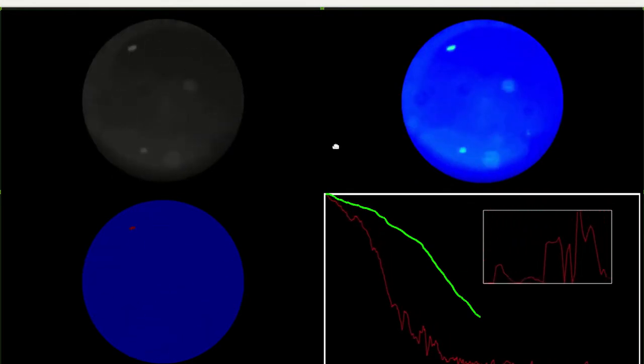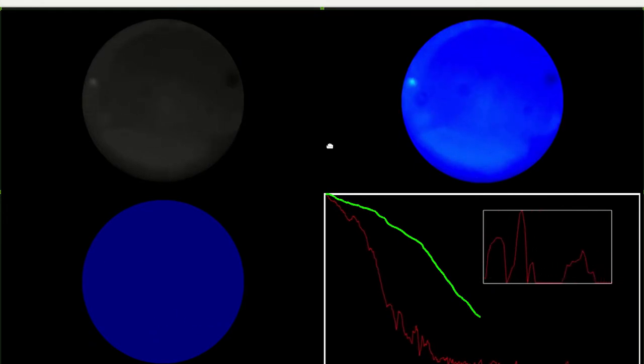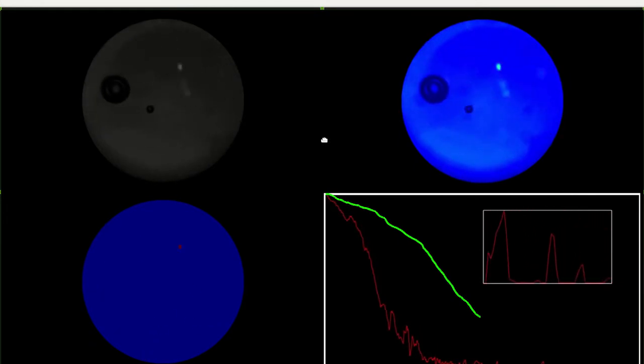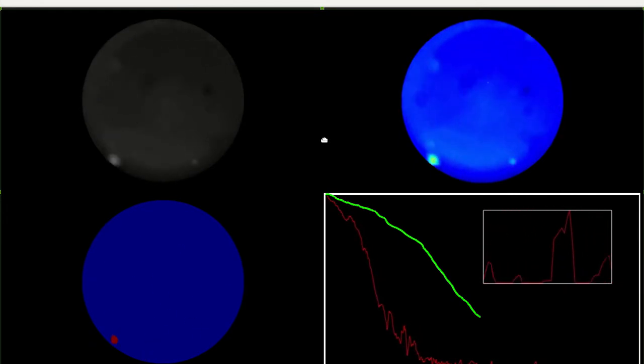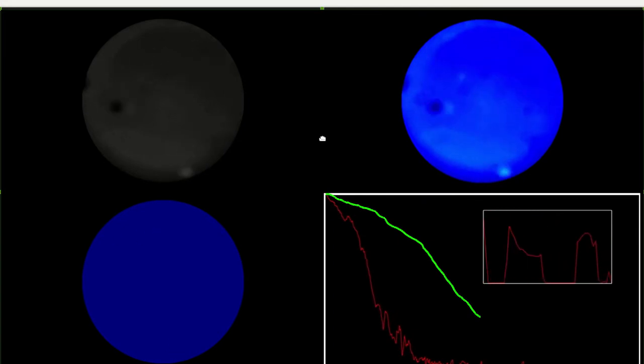This strongly suggests that we can use the Oculus as a measure similar to that of FBRM to measure the API dissolution in the presence of many air bubbles.